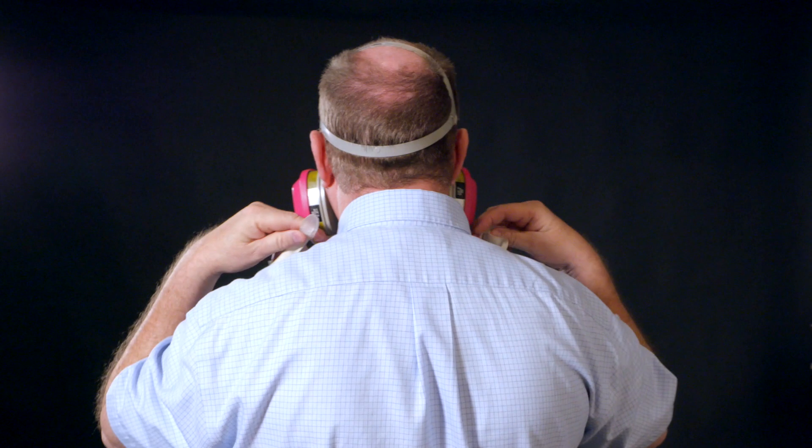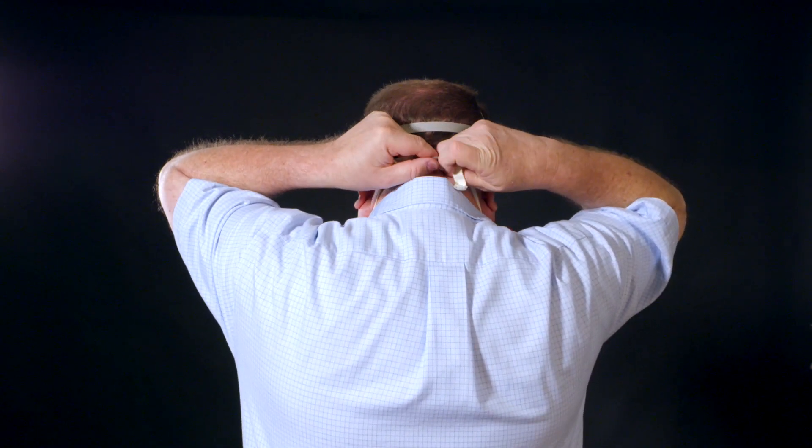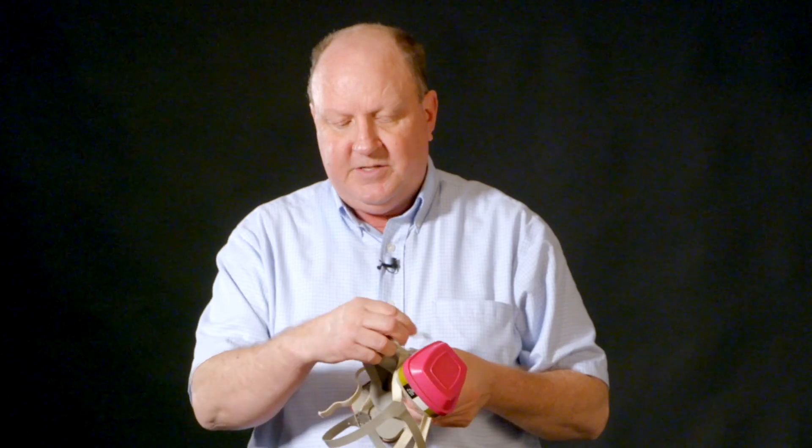The next thing, of course, is you will be attaching what is known as the neck strap. These are adjustable, which basically means you can move them in or move them out to fit your particular needs or your particular size. Once you get the neck strap and the head strap put on, it'll actually be time for you to start pulling back and trying to get a good seal around the nose or the facial area of the respirator.